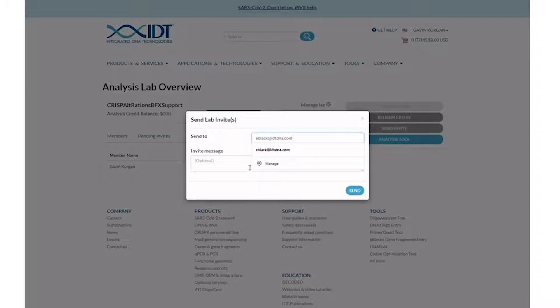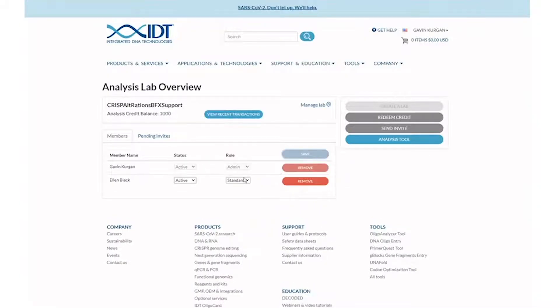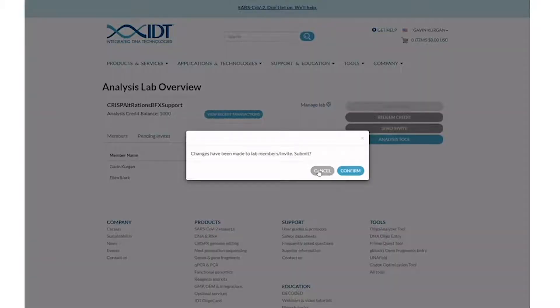Enter a list of colleagues and add a customized message to their invitation. Control user privileges by setting permissions for each individual.